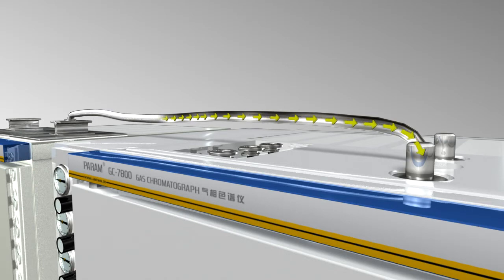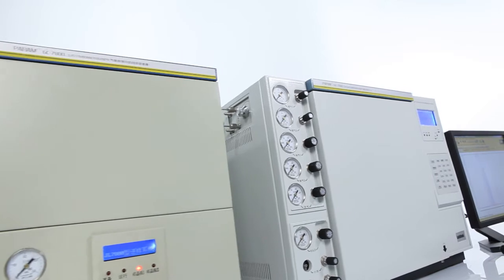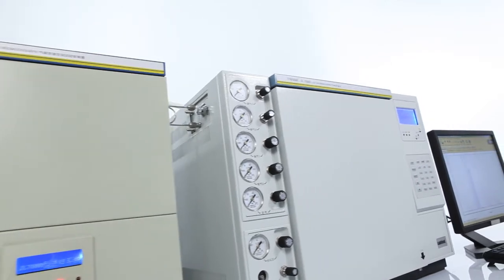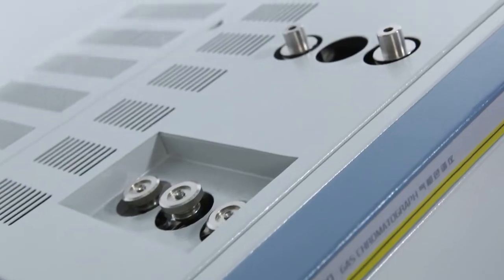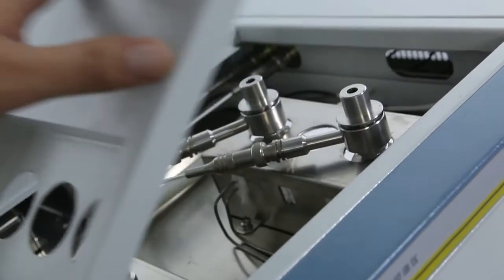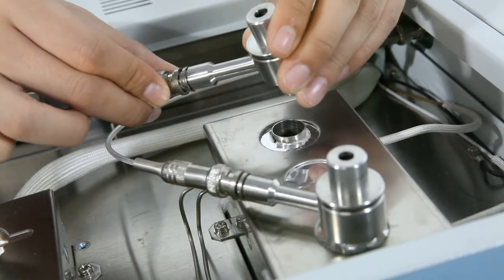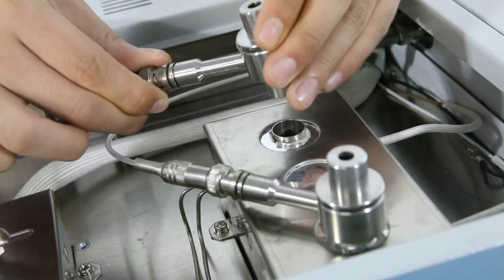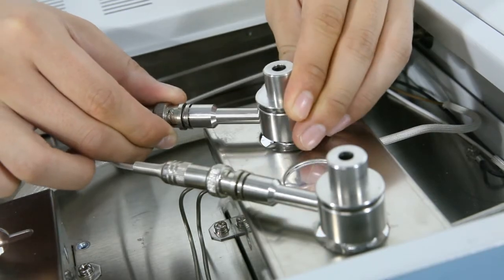The GC7800 gas chromatograph adopts modular design which means simplified system structure, independent functions, convenient upgradability and easy maintenance.